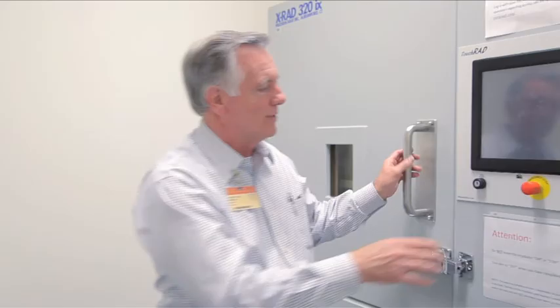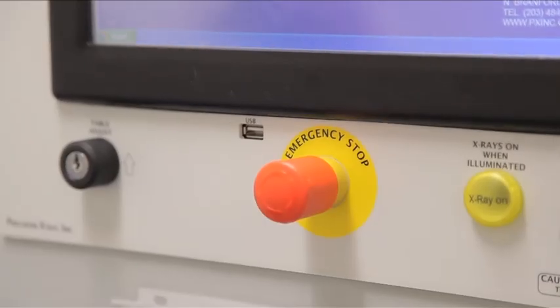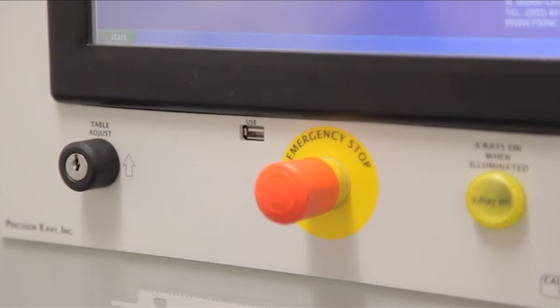When you come into the room, the first thing you're going to do is turn on the machine. You'll also notice there's an emergency stop button that will allow you to stop the machine at any point during the irradiation if a problem occurs. When the irradiation is on, there are two lights that come on — one here and another light up top as well.